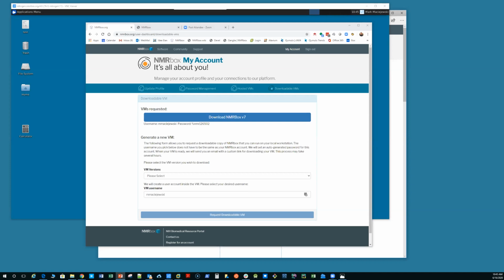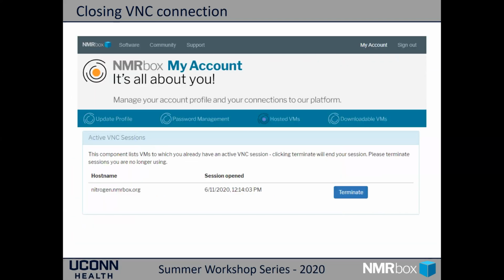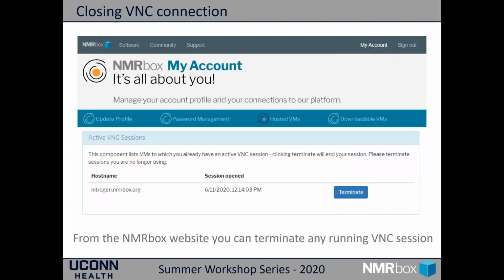I think I'm going way over time here, so I'm going to try to speed up a little bit. I'm going to pass through this, because this is how to close the sessions, which I just did with you.